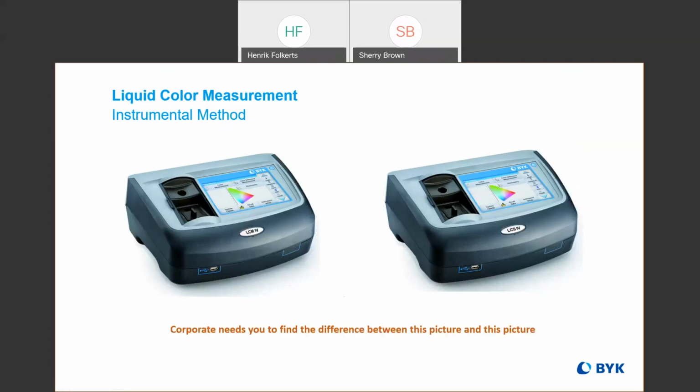So that brings us to our instrumental color evaluation for transparent liquids. And we have two instruments for that. One is called the LCM4, and the other is called the LCS4. And they do look identical. They have the identical outer design at least, but the LCS actually has a lot more capability than the LCM. So the LCM has a simple set of scales, and the LCS is a bit more robust.